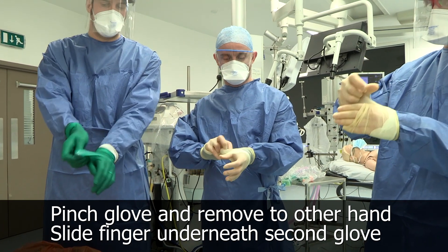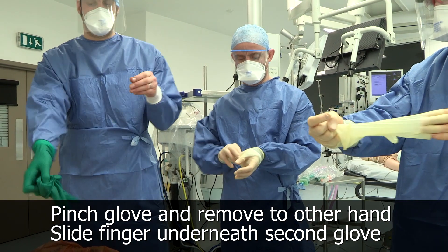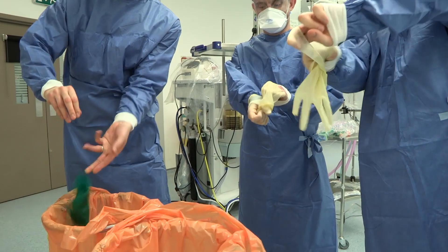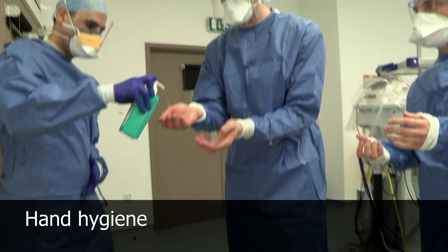Anatomical snuff box — glove, pull the glove off in one hand and then slide your fingers underneath, never touching the outside of the glove and straight in, so that we don't have to touch it.